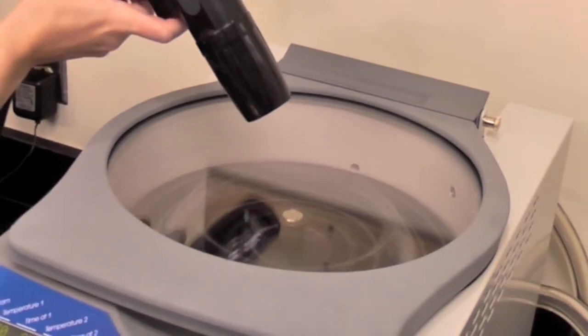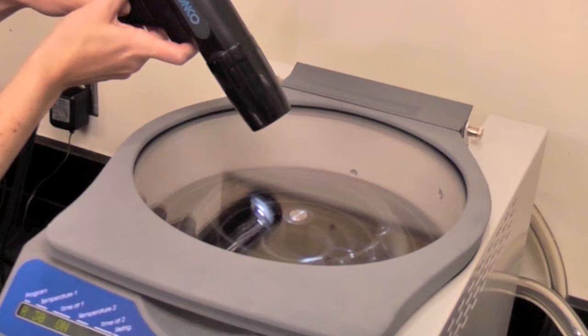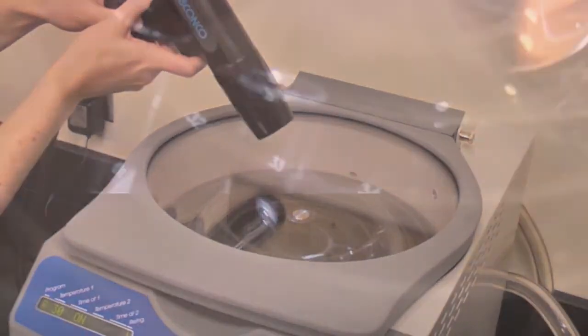The accessory Centrivap allows you to see into the chamber to determine the sample's progress. It saves 20% of evaporation time because the chamber does not need to be opened to see if a sample is dry.